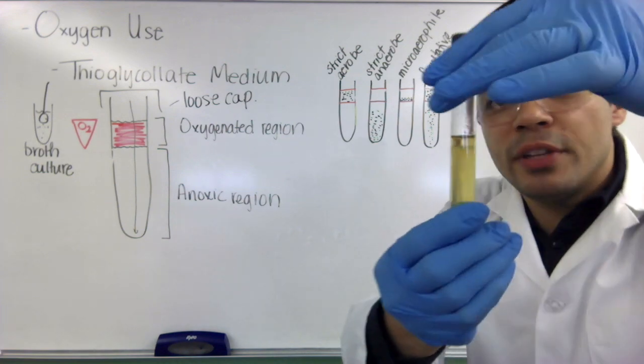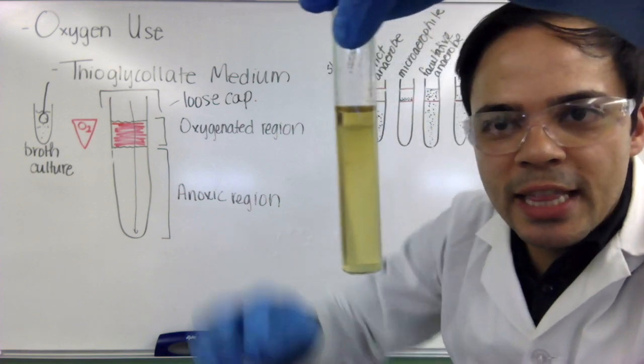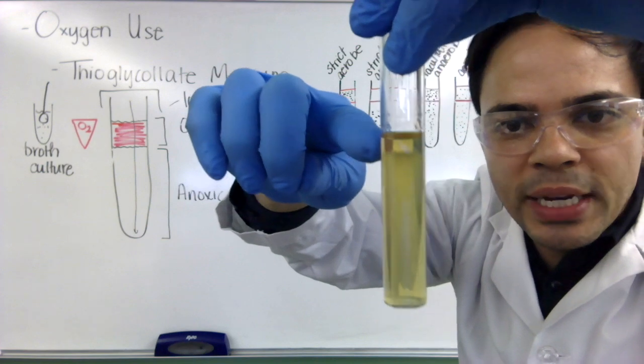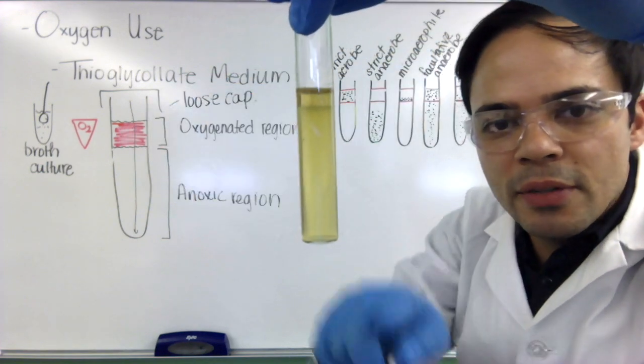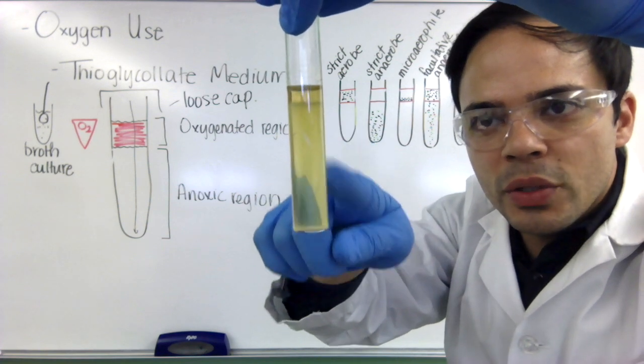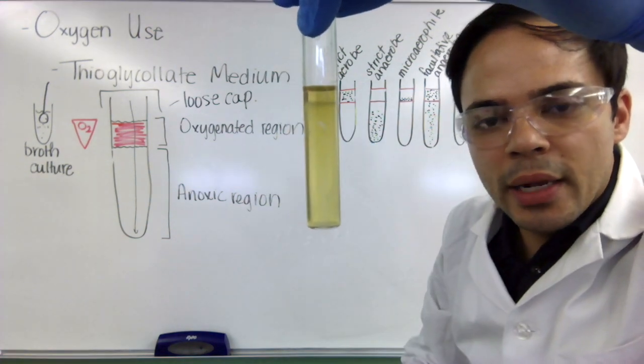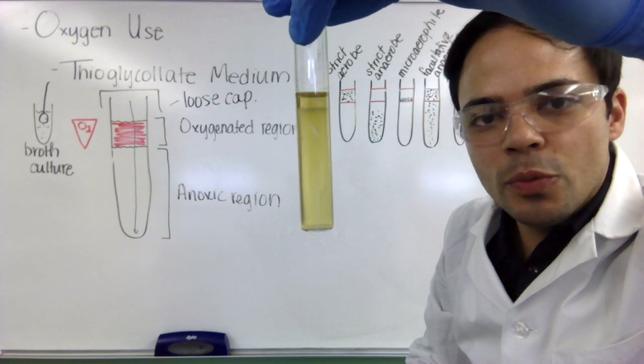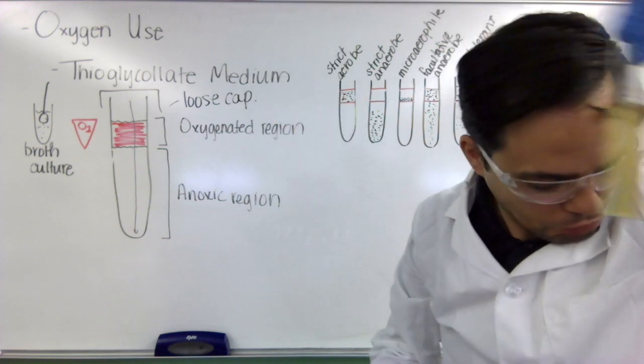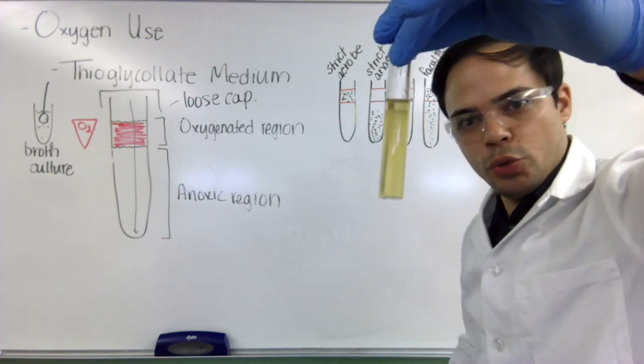If you look very carefully here, you can see that the top here, the oxygenated region has nothing growing in it, but there is lots of growth in the lower region here, the anoxic region. So this would be a strict anaerobe and this happens to be a species of clostridium. So this one's a strict anaerobe.